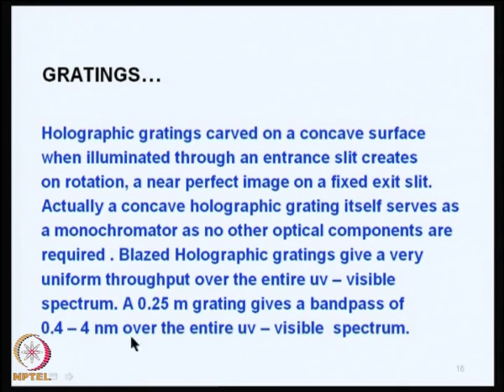You would have seen many such gratings in day to day life also with stamps. When you look at some stamps this way or this way, rotate the stamp, you will see the picture of the bird in different colors, etc. They are all made by holographic gratings.